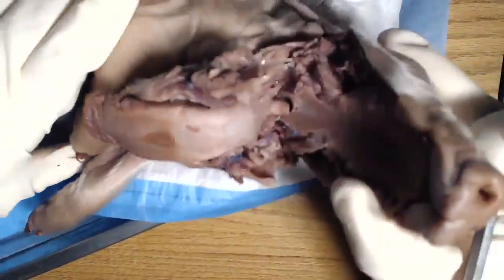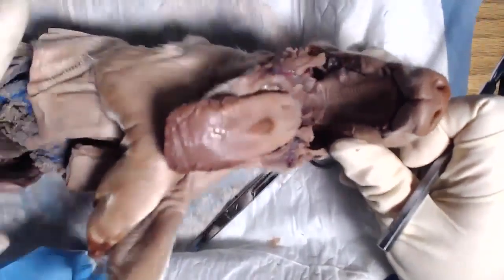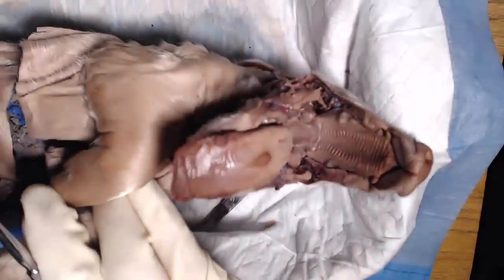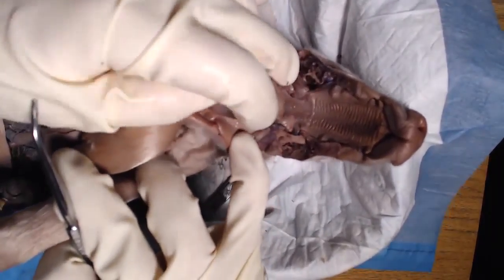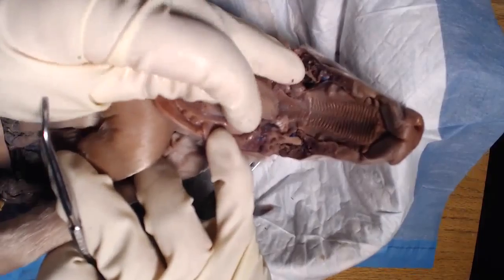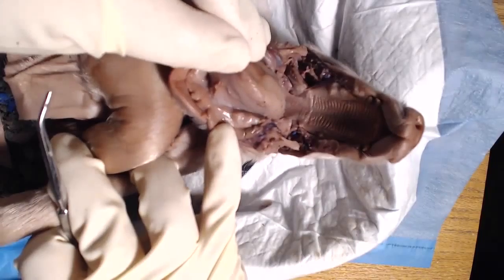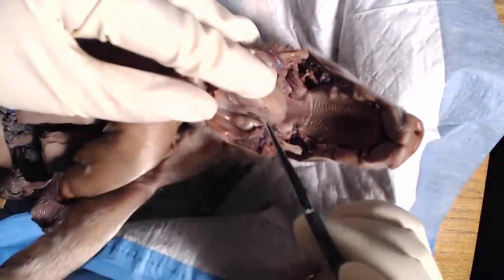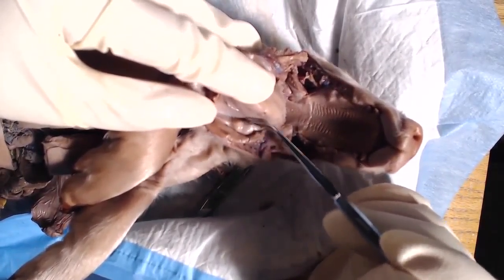All right. So hopefully you're able to identify those structures. Now we're going to turn our attention back to the pig's tongue. So at this point, you're just going to want to retract that tongue backwards, towards the roof of the pig's mouth, and towards the side a little bit as well. So you're looking basically underneath the tongue. You can see I'm pulling my tongue to the side like this, and I'm looking in the space between the pig's tongue and its gums, where the teeth are erupting.